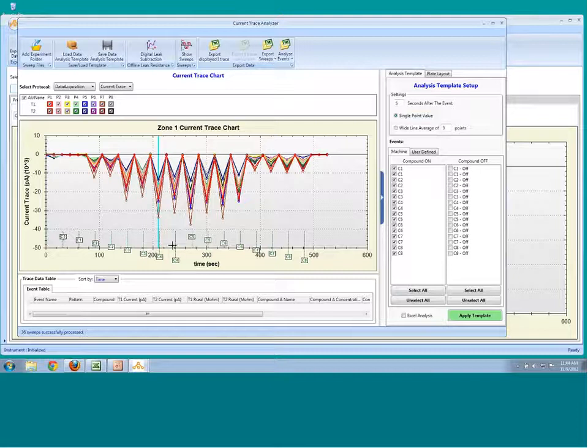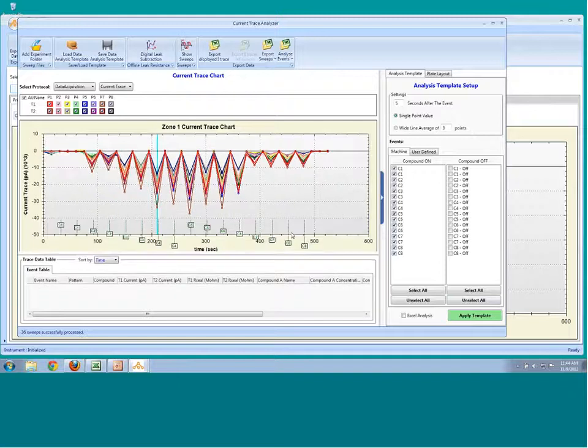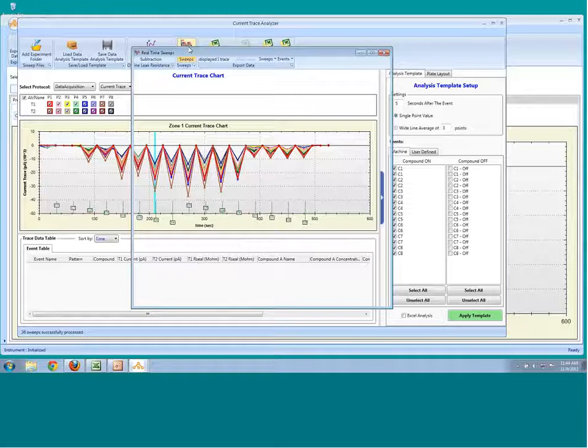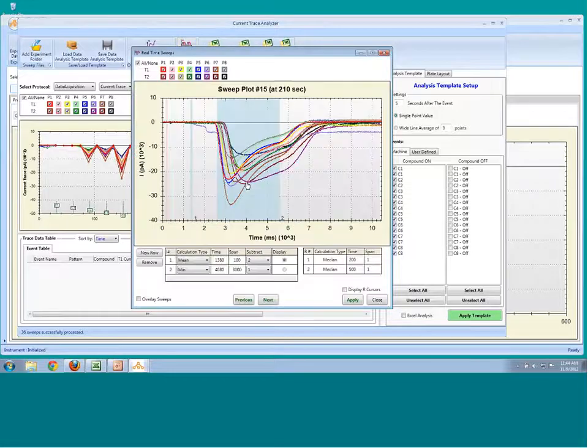So immediately after the valve is opened, then we have the valve being closed. So these would be the times of my off events. And so we can choose to turn those, to highlight those flags. Any of the flags that are being defined here, I can then select and make measurements that are associated with those flags. So now I have a set of machine-created event flags shown here, highlighted here. I have my sweeps where I went through and defined a set of measurements.